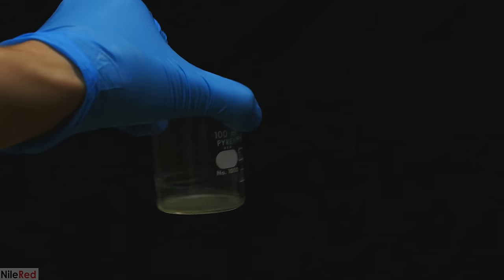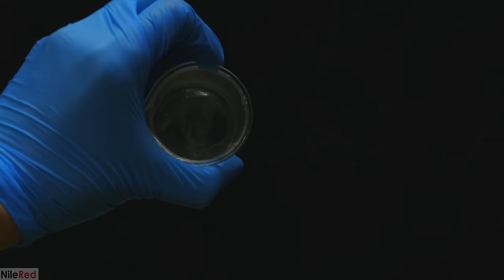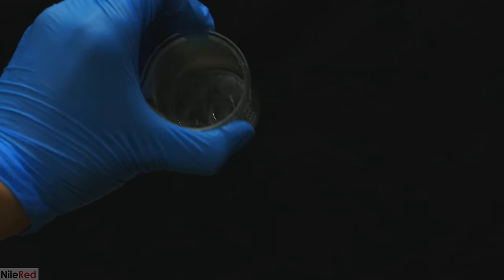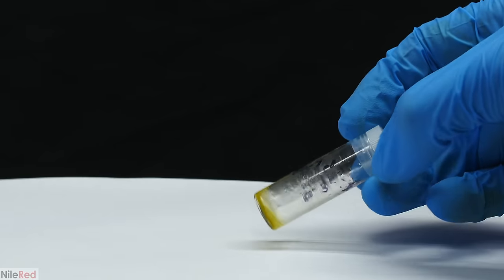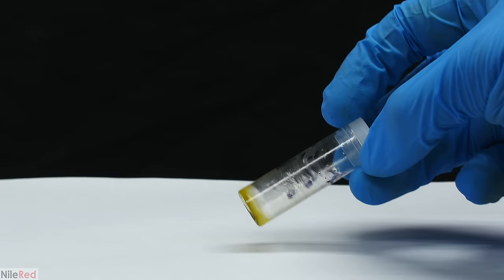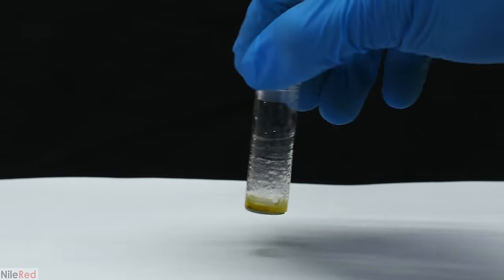Cadaverine has a melting point of around 9°C, so it makes sense that we're left with a goo and not a solid. With a little bit of skill, the cadaverine was transferred from the beaker to a small vial.